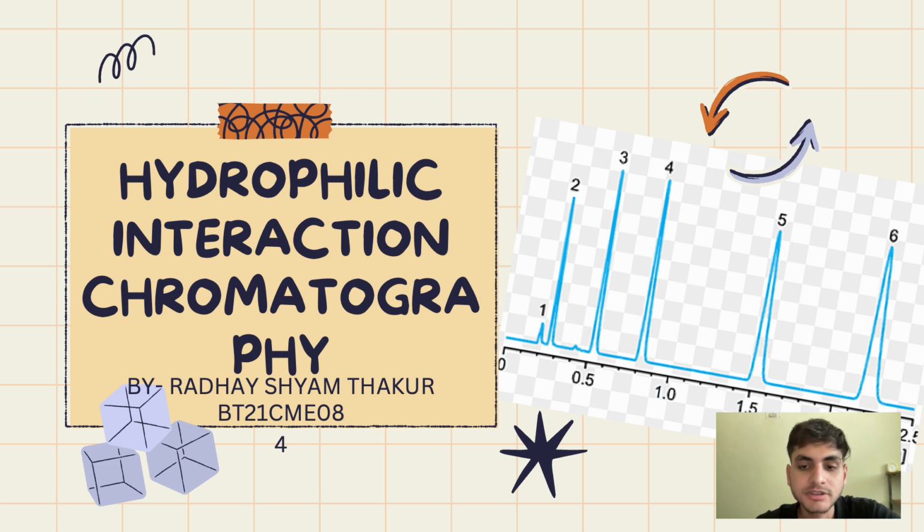So let's first understand what we mean by hydrophilic. Hydrophilic refers to material or surfaces that attract water, absorb water, dissolve in water or have affinity for water.